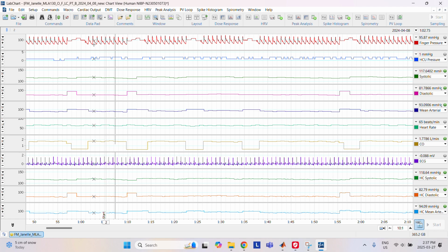We have to go maybe 2 or 3 peaks before. So you have to click on the number here, like so. And then depending on the laptop that you have, you'll either use Control F3 or Control Function key F3 for this part. So for my laptop, I use the Control Function F3, and I press all at the same time, and it gives you this little gray box.